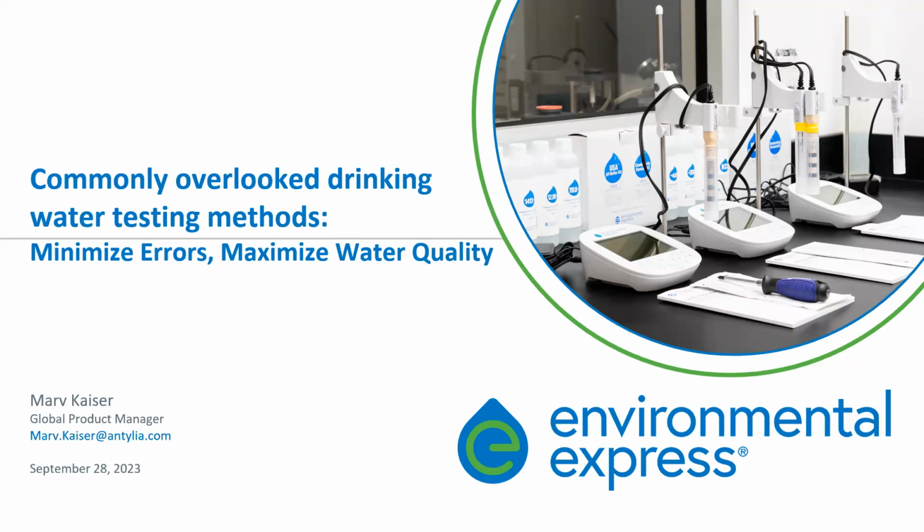Good afternoon, and thank you for attending today's Midland Scientific webinar. In today's webinar, I'd like to discuss some common drinking water test methods with a specific emphasis on turbidity and chlorine colorimeter.